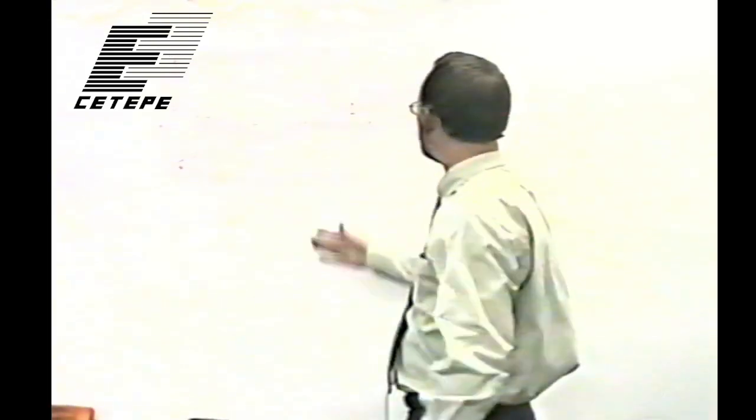What I've done, this is basically how the thing looks. They're pretty bulky devices, which is one of the reasons that they want to get rid of them and replace them with these very compact solid-state devices. The one we use is about this big and this big around. So this is fairly close to life size.